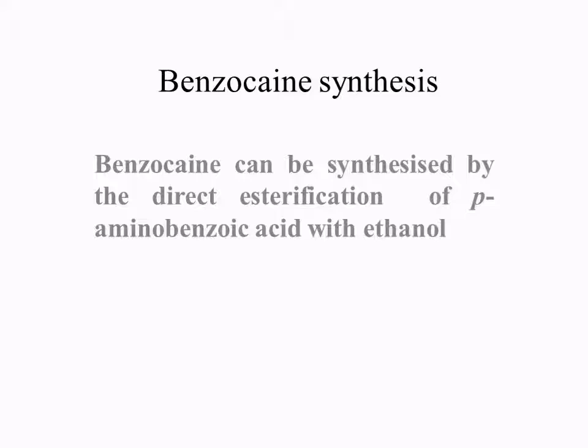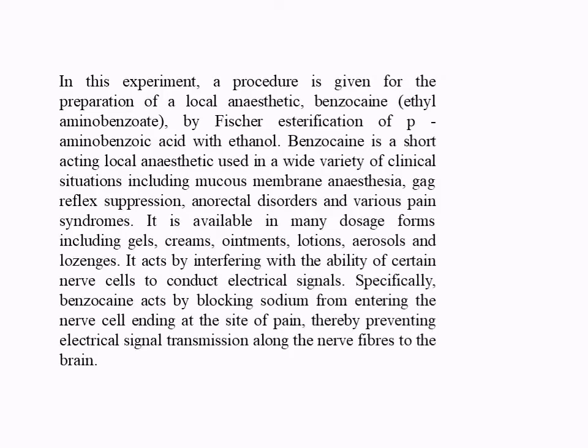Benzocaine can be synthesized by direct esterification of para-amino benzoic acid with ethanol. In this experiment, a procedure is given for the preparation of a local anesthetic, benzocaine, ethyl aminobenzoate, by Fischer esterification of para-amino benzoic acid with ethanol.